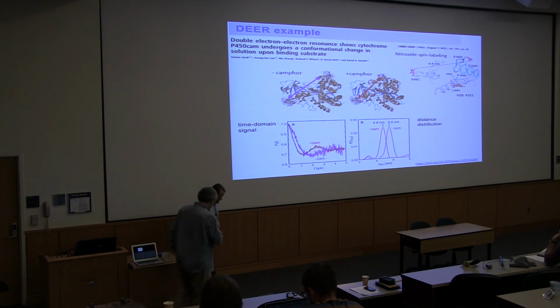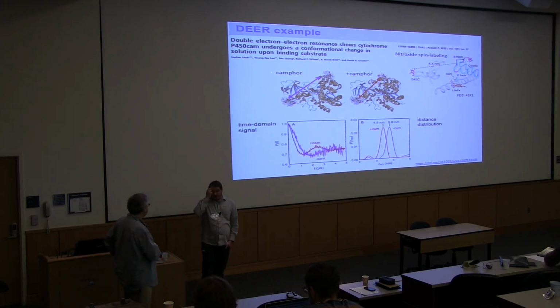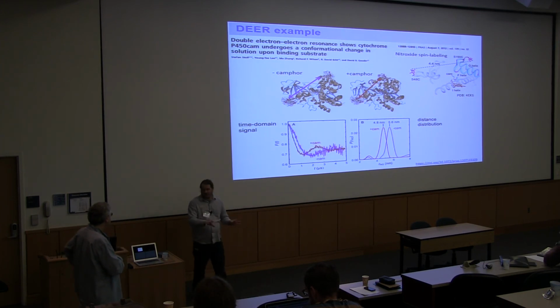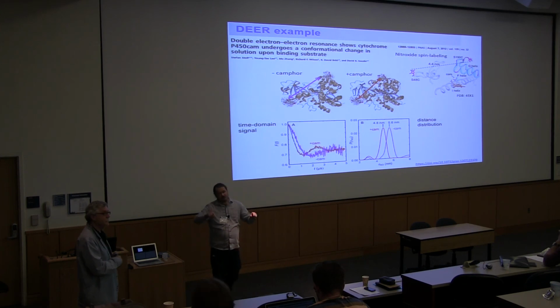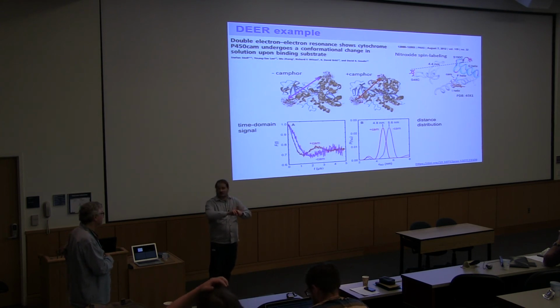In MIMS and Davies ENDOR? Well, there is no easy answer to that, because depending on the sequence, blind spots originate from different parts of the problem. Let's start with the simple one actually. In Davies ENDOR, what you have to do is to have a selective microwave pulse that selects one of the two EPR transitions that are split by the hyperfine coupling. The problem is if the hyperfine coupling is very small, there is no way you can do selective excitation. And as you are not selective anymore, there is no ENDOR effect. And that's the blind spot for that.